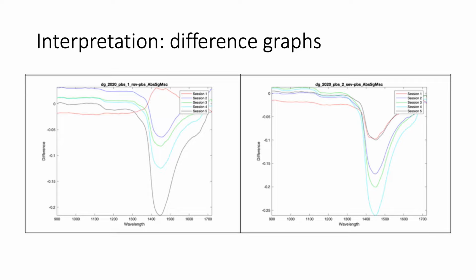In conclusion, this paper presents a data-driven study demonstrating that aqueous dispersions of the two common respiratory viruses can be distinguished with a high degree of accuracy based on their NIR spectral responses. However, how to interpret their NIR spectral differences has not yet been elucidated.